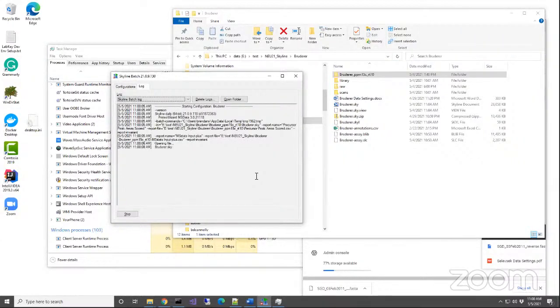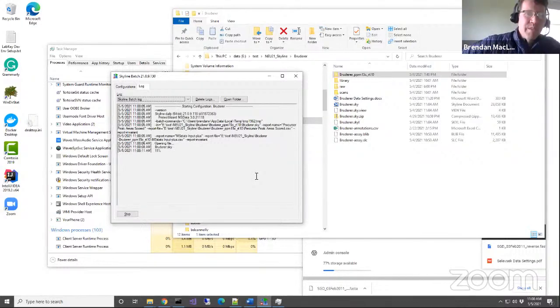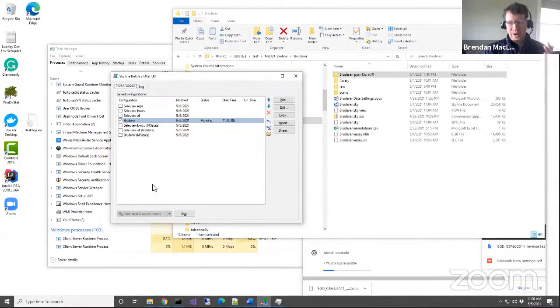So it's going to open my template file, which again is a big file. So this takes a few seconds. So while it's running, we will come back. So this is up to the allotted time. I'm going to stick around for questions for a while if people have questions, want to work through things.